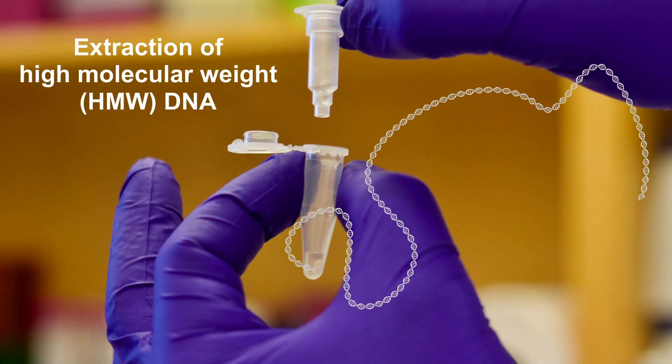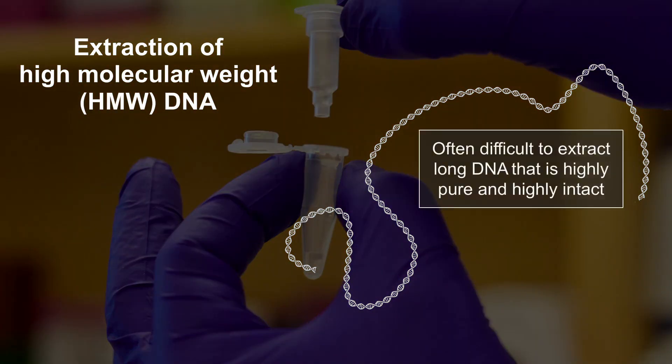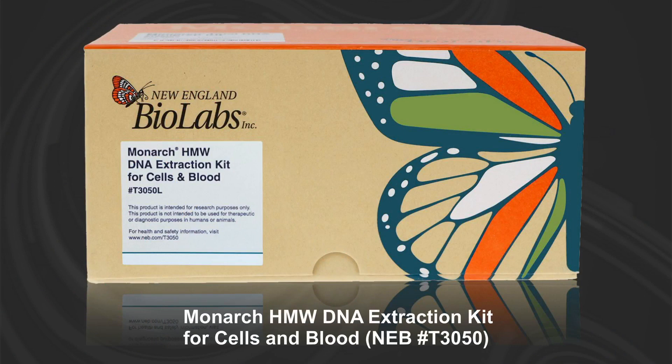Extraction of high molecular weight DNA is important for applications that require the use of very long DNA molecules, such as long-read sequencing and genome assembly. It is often difficult to extract long DNA that is highly pure and highly intact, but the Monarch High Molecular Weight DNA Extraction Kit for Cells and Blood enables this to be done quickly and effectively.